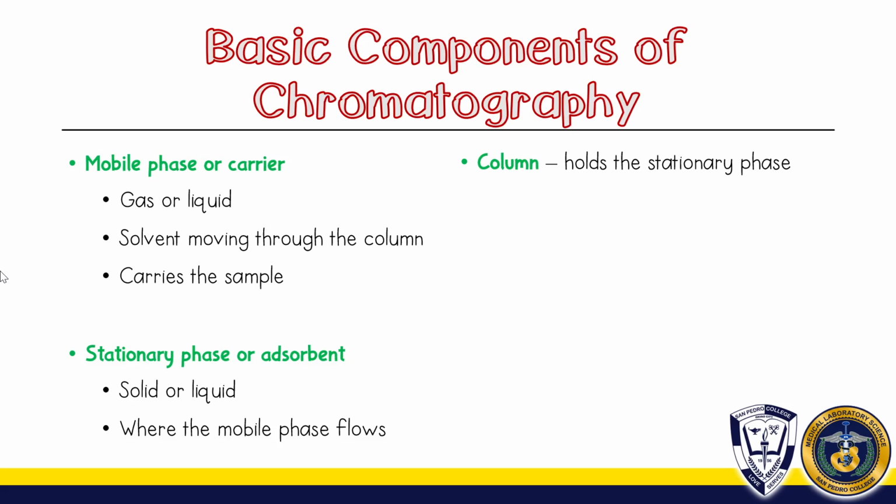Stationary phase remains fixed or does not move, kaya stationary, naa lang na siya sa inyong column. Mobile phase will enter inside your column. And kaya dyan nilalagay yung sample because of course your sample needs to move all throughout your column so that separation may occur.